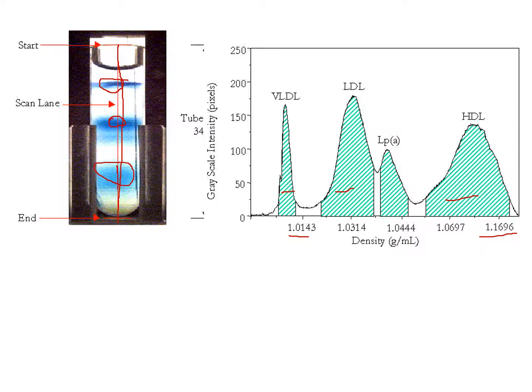Okay, and so we can actually, this is triglyceride, a little peak in here as well. So we can look at your lipid profile, if we had enough time, and get exactly how much you have. You can integrate, if you remember your calculus, these peaks and figure out exactly how much of the total each one of these fractions represents, so you can get a percentage of the good versus the bad cholesterol.